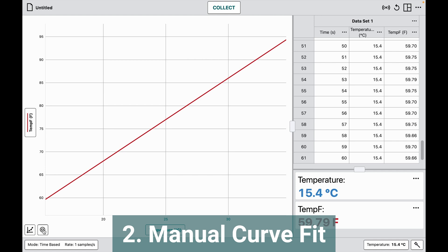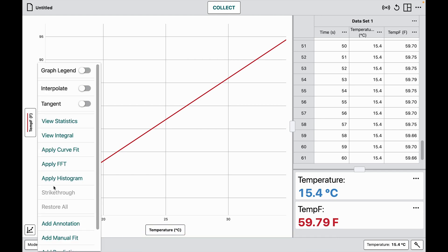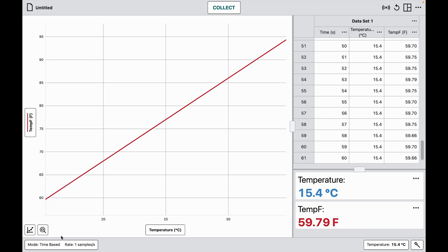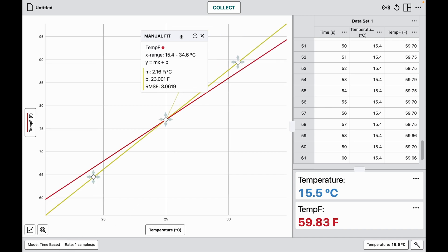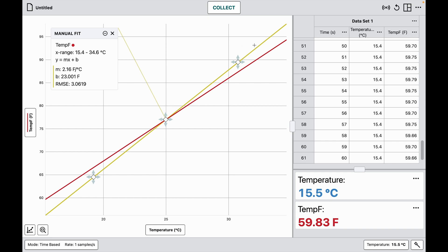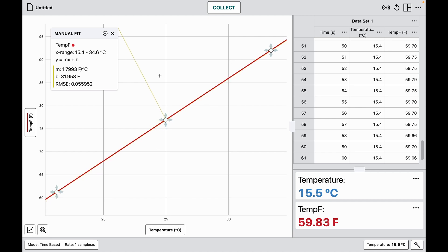Another feature of the Pro version of Graphical Analysis is the ability to manually fit data with a line. I choose the graph options button, go down to add a manual fit — a line that allows me to drag it around. I can choose either endpoint to drag, or drag the middle, to get the best match to my data and find the relationship.